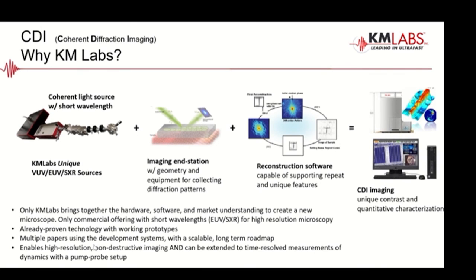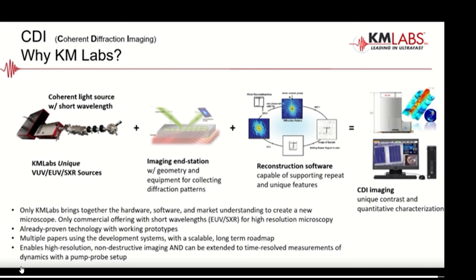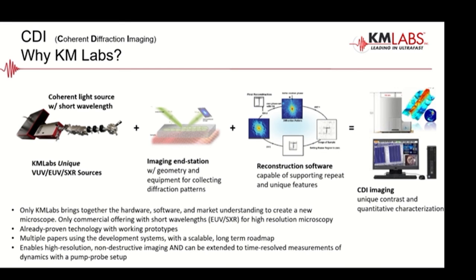And of course, we can also extend this to dynamic imaging by leveraging the ultra-fast pulses of light that we have, or complementing it with additional modalities that we've seen in some of the other training modules, things like ARPES or pump probe spectroscopy or PEEM and so on, that can also benefit from these types of sources.